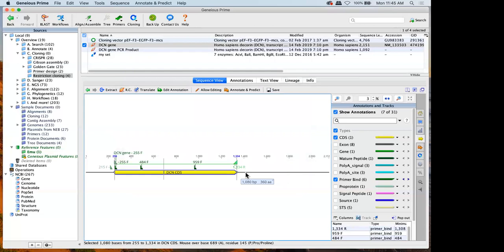So that's a little bit about primers. You can also do designing primers on things like annotations, on alignments. The next thing I think we're going to talk a little bit about is the various alignment options in Geneious. Any questions though on primers, or anything else on anyone's mind at the moment you want to bring up?